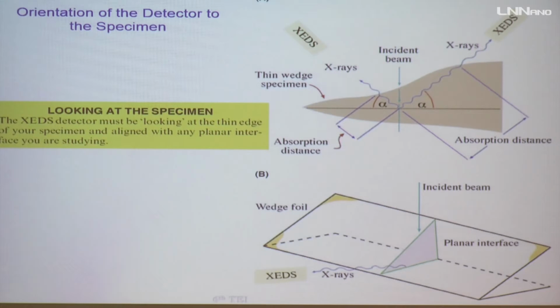Well, related with these conventional detectors, where you have conventional microscopes with just one detector attached to the column, we have problems related to the relative position of your specimen and your detector. If you have your detector here, you can imagine which kind of sample you have here.